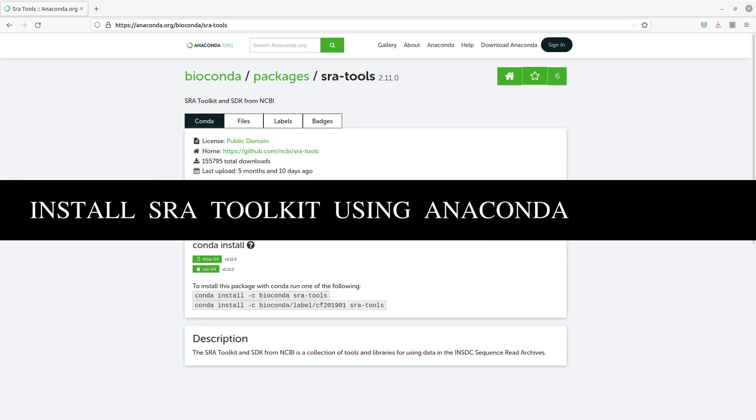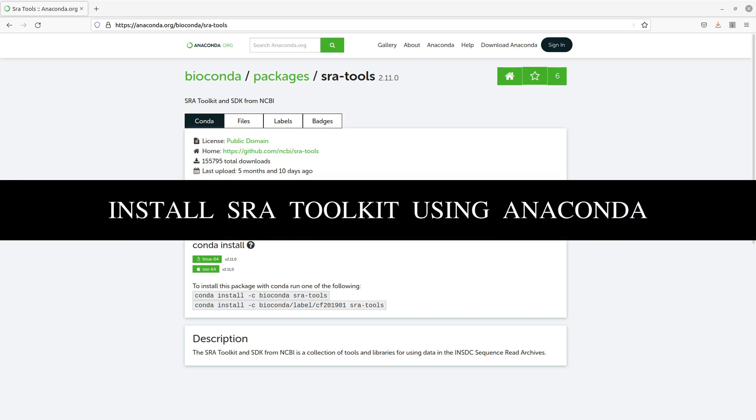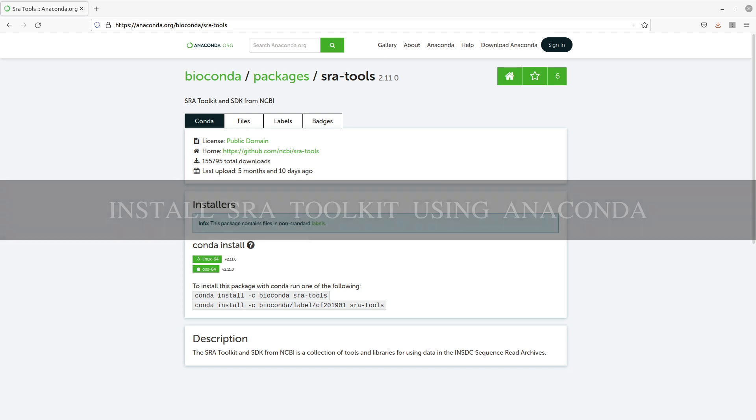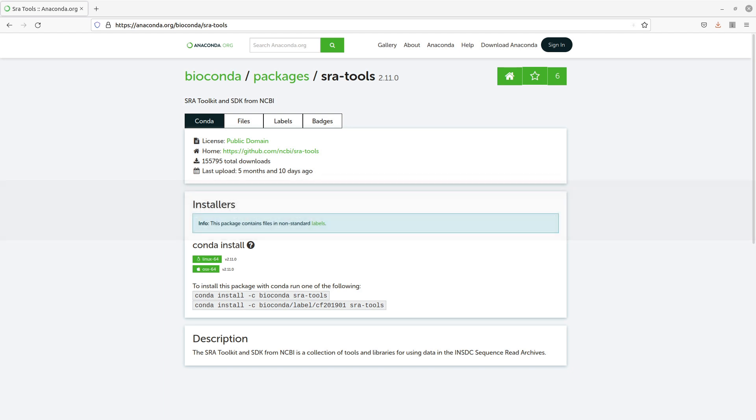Hi everyone, welcome to the second part of the video tutorials on how to install the SRA toolkits. The SRA toolkits is a collection of tools and libraries for reading, downloading and accessing data from the sequence read archives. That's NCBI data repository.